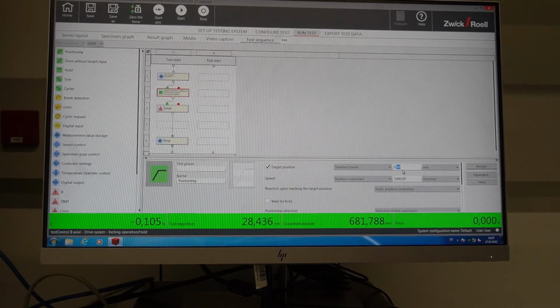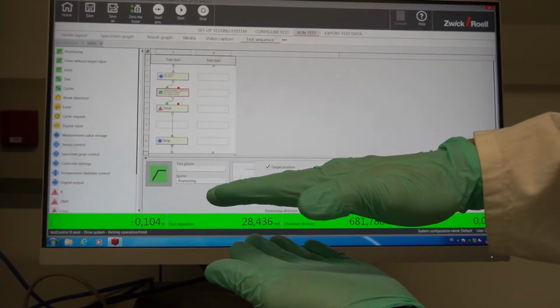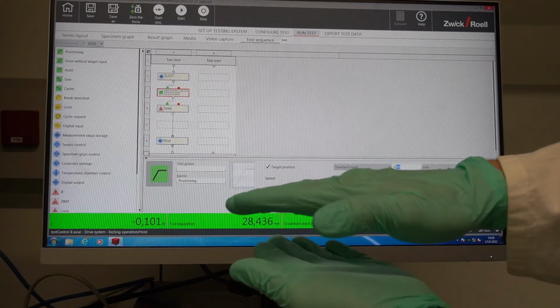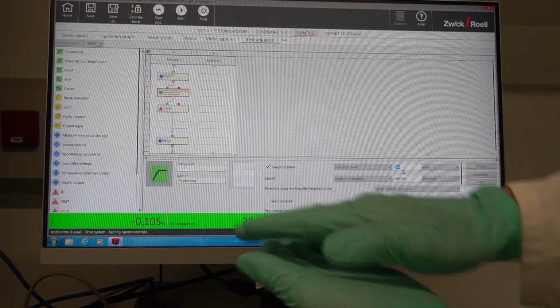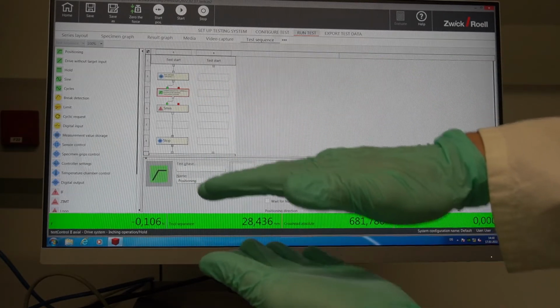This is the software, and now what test protocol are we applying? It is a relaxation test we are doing. That means we are applying a step load on the sample and wait and measure how the force signal is evolving over time. So the question is, at which strain level are we doing this test? And what I found in other publications, and which seems to be also physiologically relevant, is a strain of 12%, and this corresponds to 0.72 millimeters of step displacement.